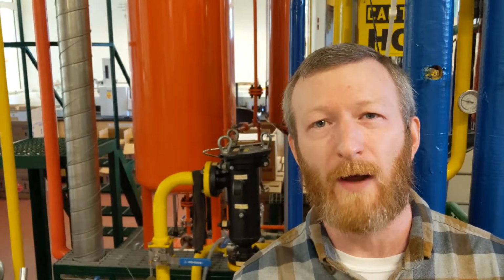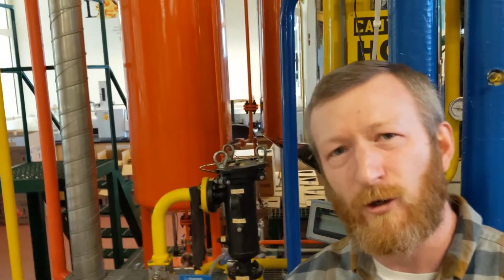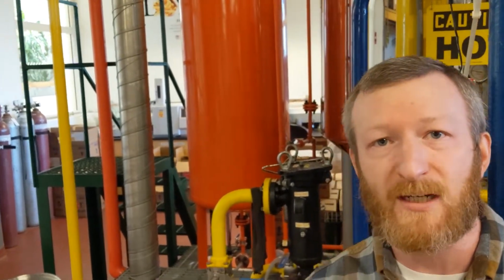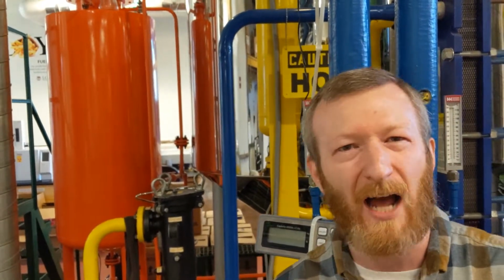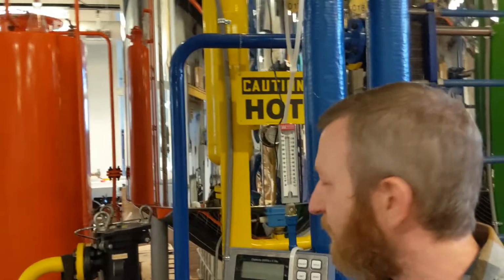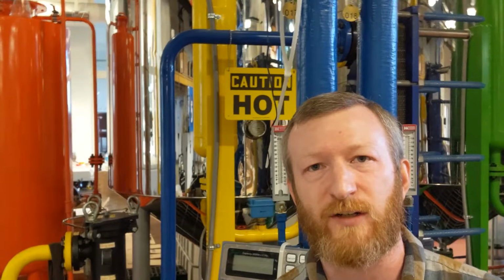We'd ideally like it to be beneficial. So by choosing potassium hydroxide, it ensures that one of our byproducts further down the line in the process is going to be more easily utilized on campus. That's great. So this is purposeful design all throughout the process. So our methanol and potassium hydroxide are mixed in that orange tank. Those are then mixed with the hot oil at 60 degrees Celsius. It's not burning hot, right? It's a nice, nice warm temperature. So that mixes then in our reaction vessel.